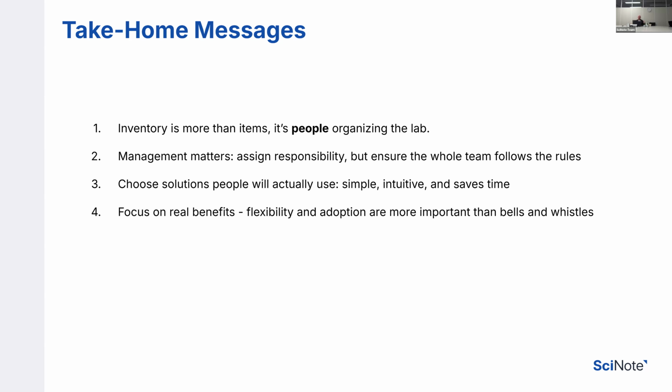But the second thing for change management, include your team members. I've seen this countless times, and it's true for everything, not just inventory software. You need to include your people. They need to understand why you're doing this and what's going to be the end benefit for them, right? And you can use my slide from before. You're going to spend 1 hour a day less on just doing your operational work about inventories. I think this is going to be a good argument for everyone to say, okay, good. As long as I don't have to do that, I'm happy.